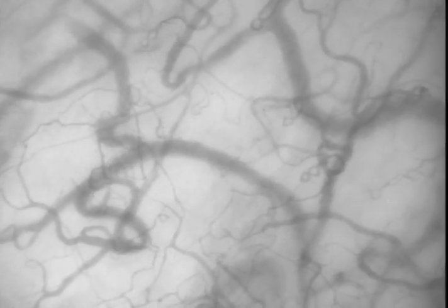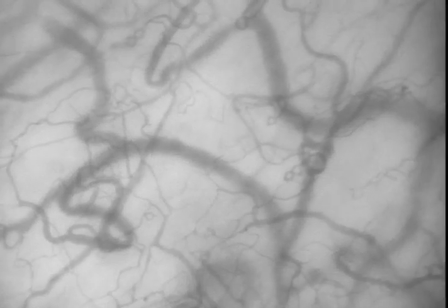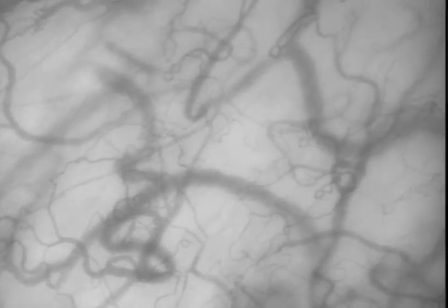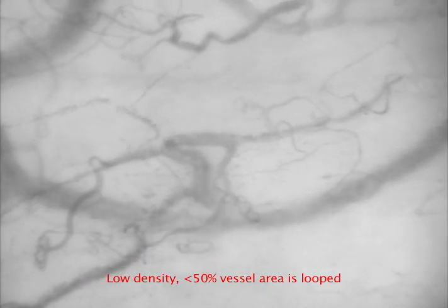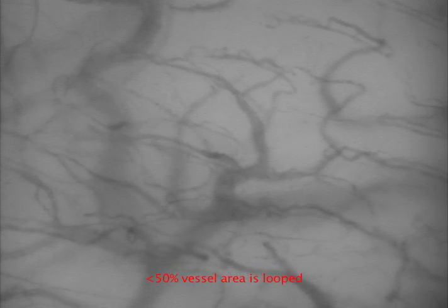Here you'll notice that there is more vessel surface area that is looped upon itself than in the previous set of videos. These loops present a problem when we're doing analysis because they're very hard to trace out and they can represent a false sense of flow. You'll notice that some areas of the vessels are bundled upon themselves or very tortuous. These are what we consider loop vessels.